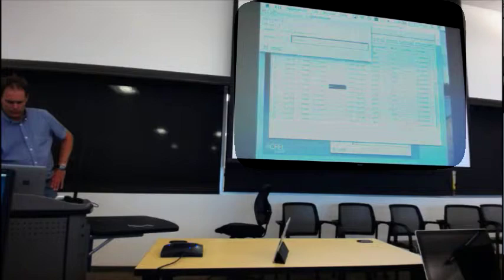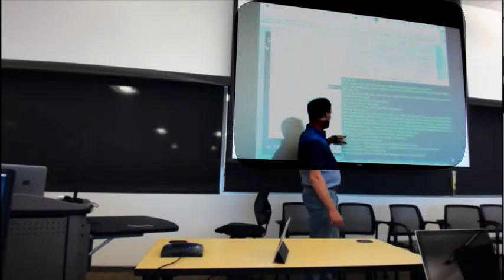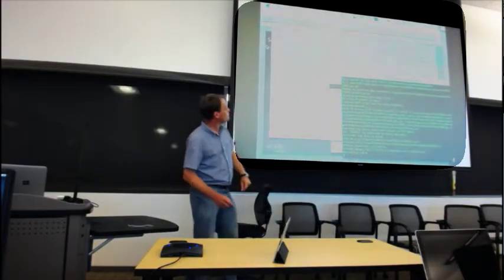If I bring now, let me see if I can bring somewhere an X11 window. If I can bring this, that's not it. Window PS login. So with this thing, you can see a little bit of text appearing here. If I click OK on this, it launches a bunch of stuff here. It says searching for XTCs, putting the HDF5 data here, moving to that directory, deleting your previous files, and then launching things. Job sent to the queue. Job whatnot is sent to the PS Anna batch queue, and so on.